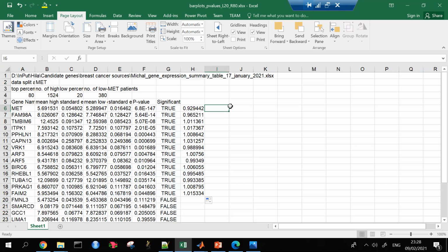You would agree with me that having an expression of -3 and 3, if you divide them and take the absolute value, you get 1, and you will agree with me that the distance between them is quite significant.